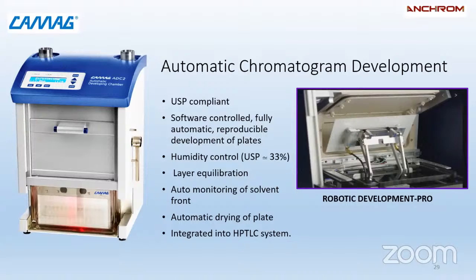This is the automatic chromatogram development chamber, ADC or ADC2, which is used for isocratic development, which is compliant with United States Pharmacopoeia. All the important steps of the development, that is plate development, chamber saturation, plate drying, everything is done automatically by this instrument.